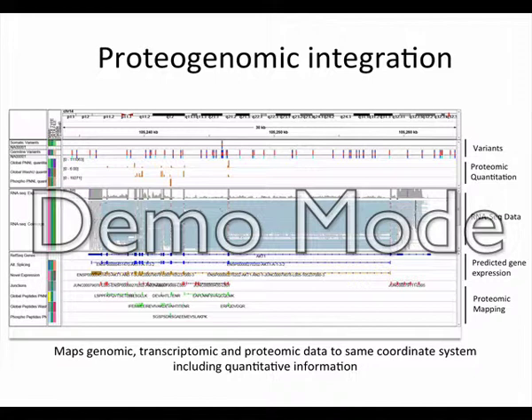So we use PGX to get the genomic coordinates, and then we use IGV to input all of that data. But you need to do that first step first, because otherwise IGV doesn't read proteomics data. Yeah.